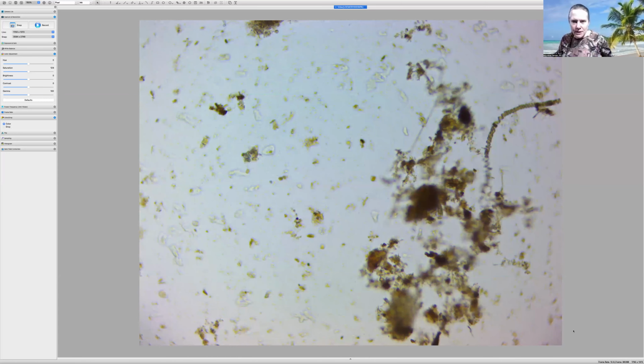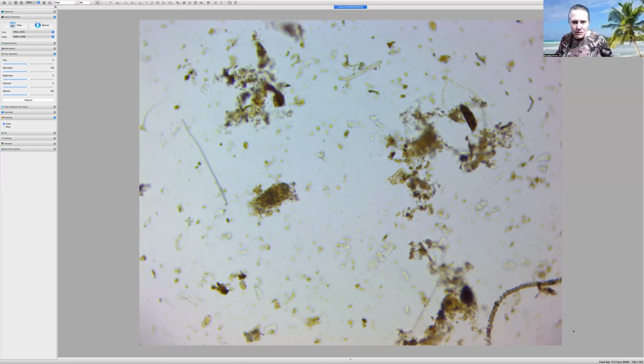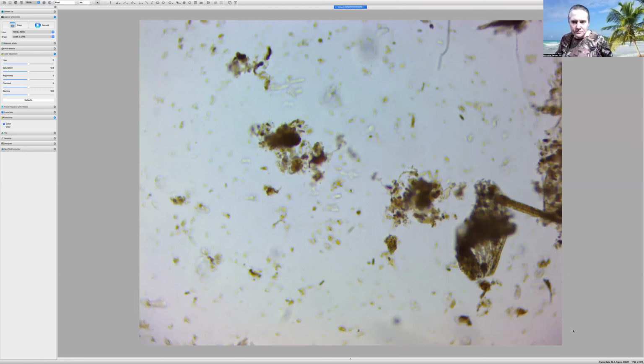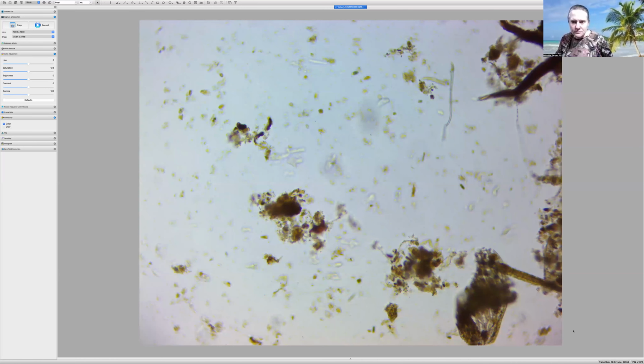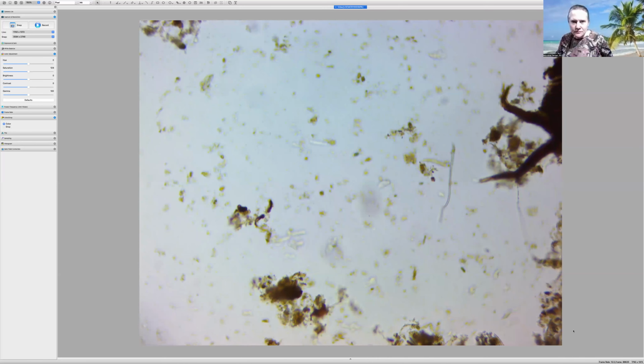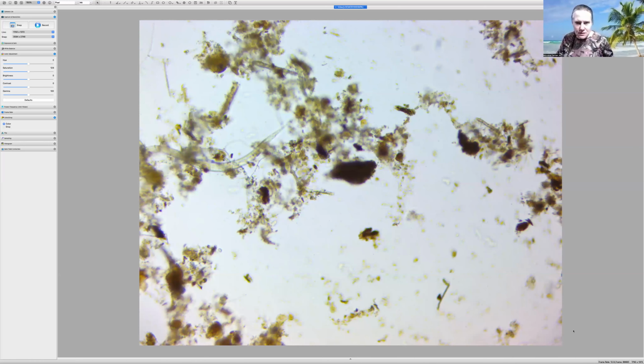I've already gone way past my time when it comes to keeping the video short, so. Just so much to see. More ciliates than before, I'll say that. There's a nematode.